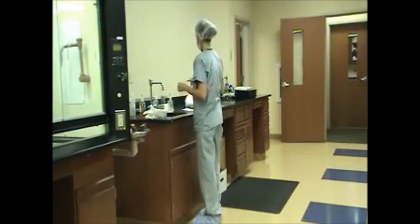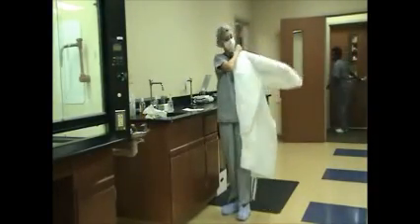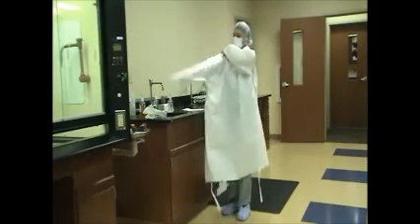Selects appropriate sized gown, examining for holes, tears, or other defects. Dons gown and ensures full closure.